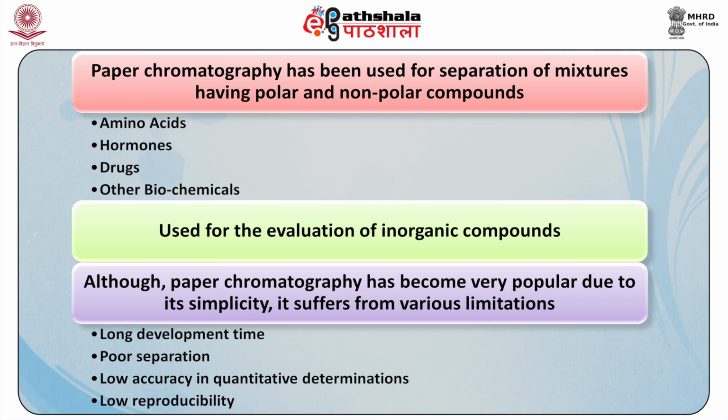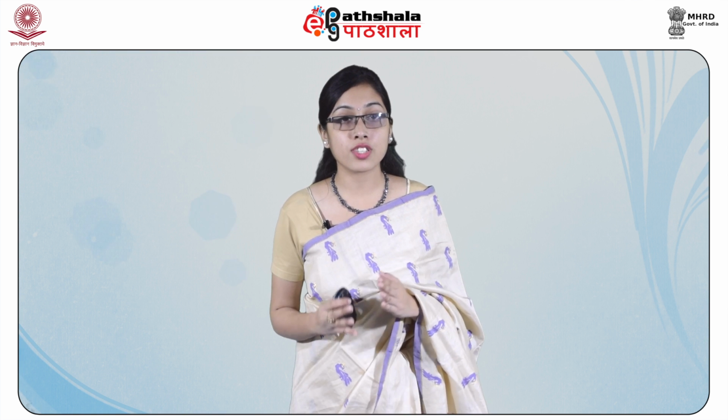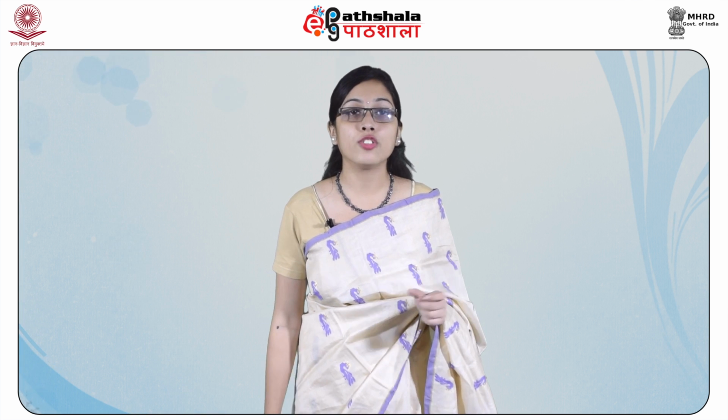Although paper chromatography has become very popular due to its simplicity, it suffers from various limitations such as long development time, poor separation, low accuracy in quantitative determination and low reproducibility. Now students, let us summarize all that we have studied in this module. Chromatography is a technique in which a chemical mixture is separated into individual components due to differential distribution of the solutes between a stationary phase and the mobile phase.